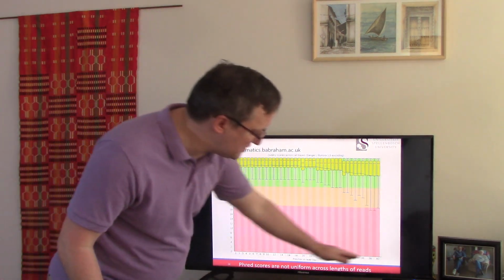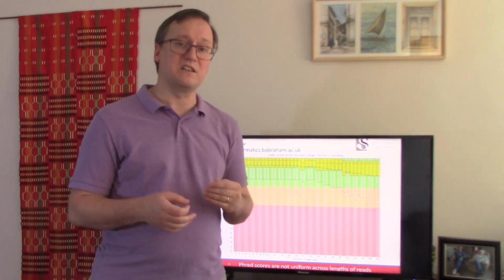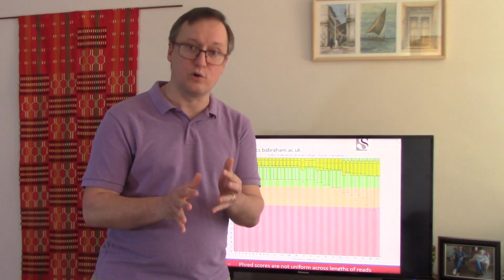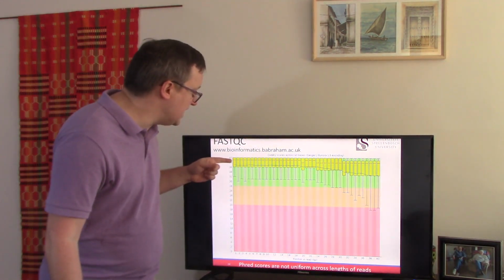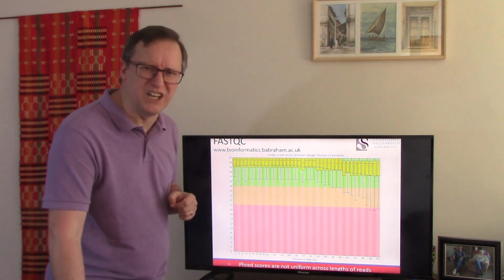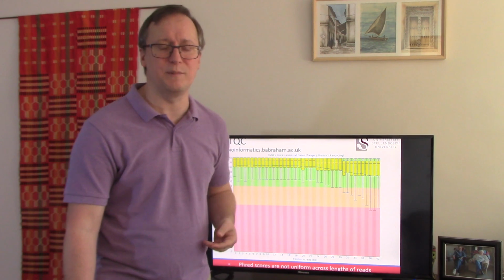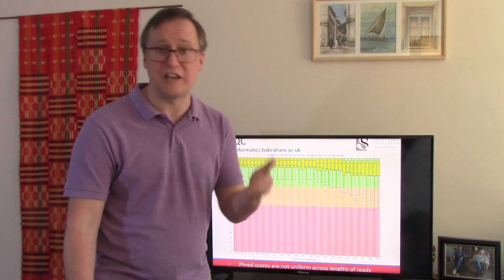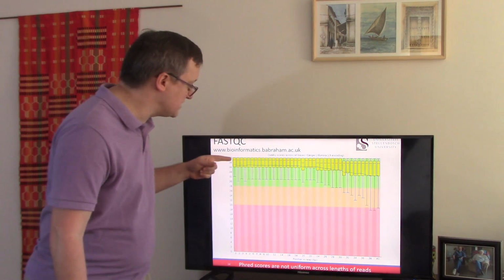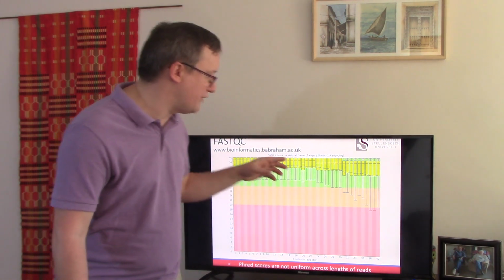For each of these different positions, averaged across all of the reads, we're asking what are the typical Phred scores observed at this position. So you can see that the medians start quite high, around 39. A Phred score of 39 is, as we experienced a couple of slides ago, about a 1 in 10,000 chance of error at this position. So we see that at the start, the medians just stay at that high level of 39 and 40.